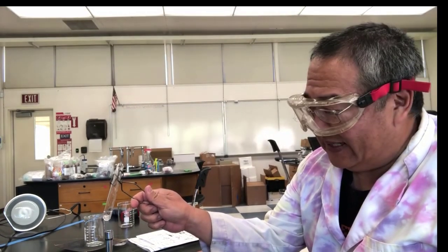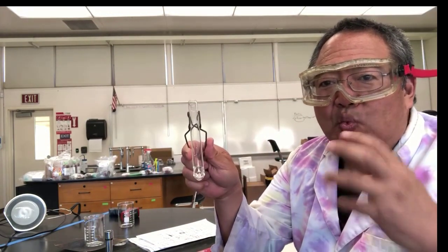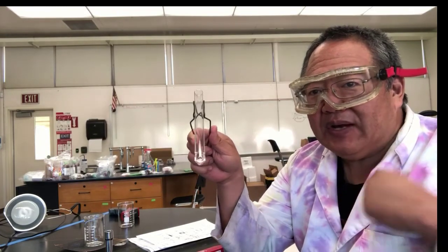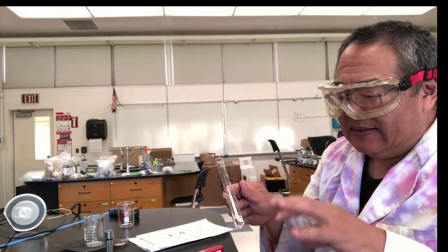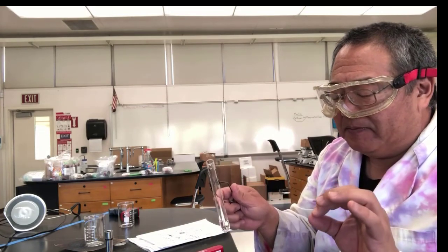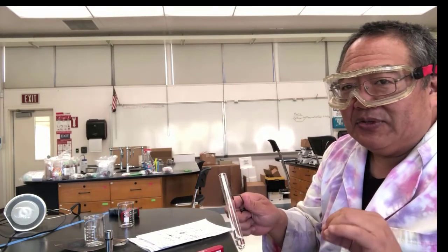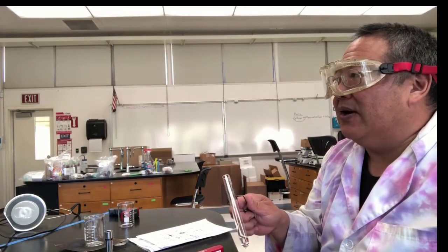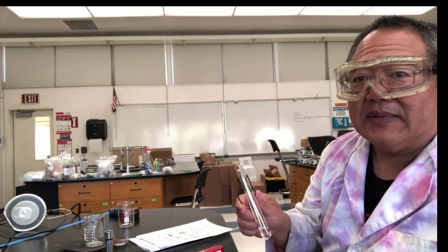It's called bumping, okay? What happens is you're heating the glass so fast, it just creates one giant bubble of water vapor and it shoots everything out of the top of the test tube. So when you do something like this, typically we'll add something to it to help it boil more smoothly. But you need to make sure anytime you're doing it, especially when you're new at this, or if you tend to be inattentive, that you don't point it towards somebody, because most of the time we're not heating water like this, we're heating something else, right?